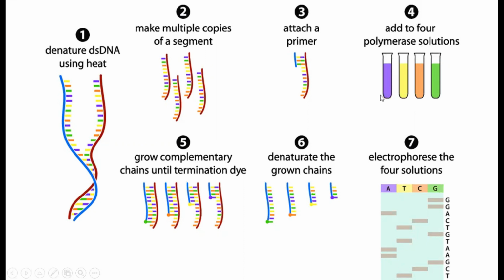Now we know that if we only add deoxynucleotides, the process will happen because there is a freely available 3' OH group, which is available for a new incoming nucleotide, right? Now, what Sanger did was he removed the 3' OH group as well, thereby creating a process whereby no freely available 3' OH group was left. So when a new nucleotide comes in, the phosphate group of the new nucleotide doesn't have a 3' OH group to interact with, and thereby the chain terminates.